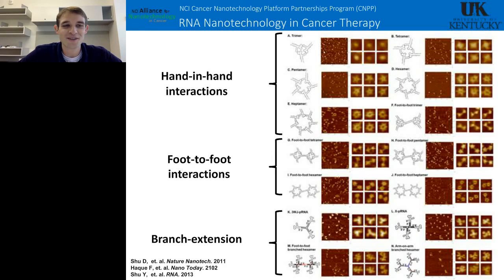So here are some nanoparticles that have been made using these 3 toolkits. We have some great collaborators at the University of Nebraska Medical Center, the College of Pharmacy, that have helped us to get these great AFM images of all these really cool looking RNA nanoparticles. You can see in the top, bracketed by hand-in-hand interactions, we can make trimers, tetramers, pentamers, hexamers, heptamers, all just based on base pairing of these loops that I just showed you.